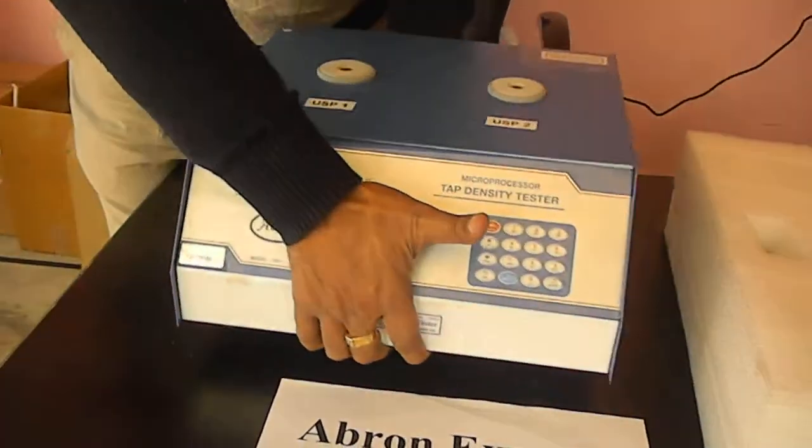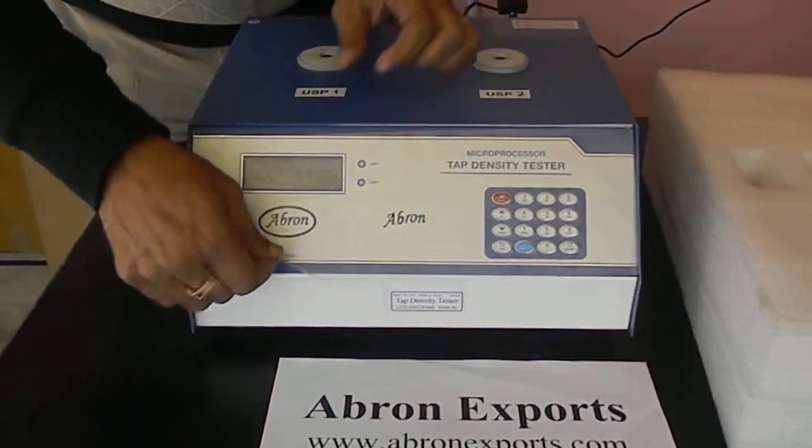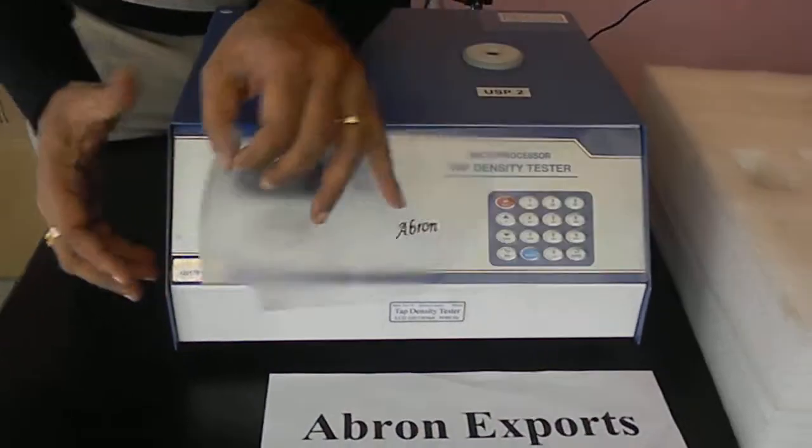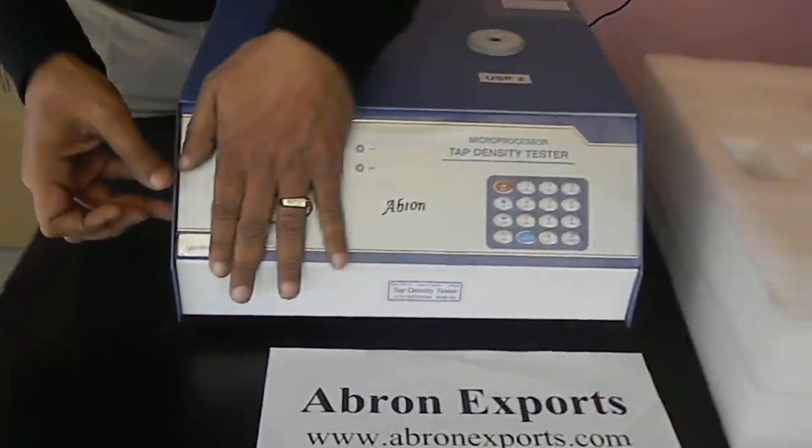On the front side there is a panel and you have to remove this for using it. You can use it with the panel on, but it is better to remove it for proper use.